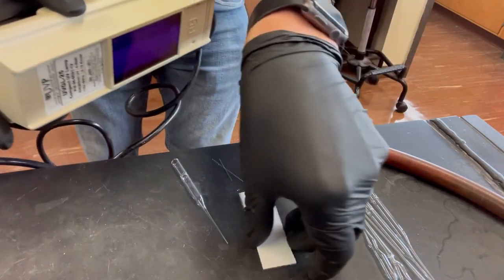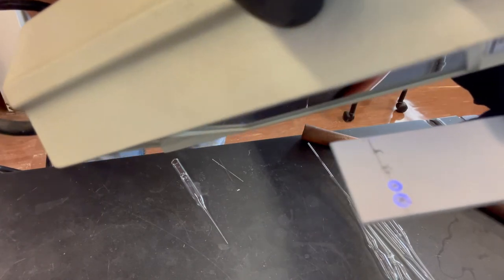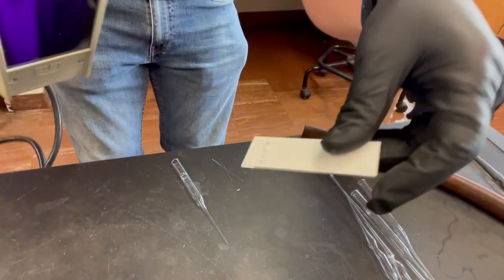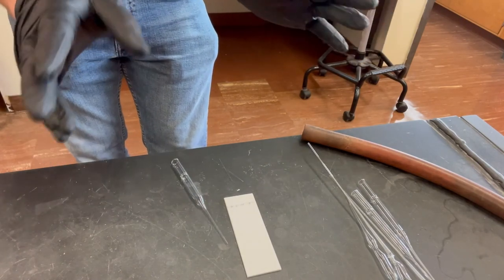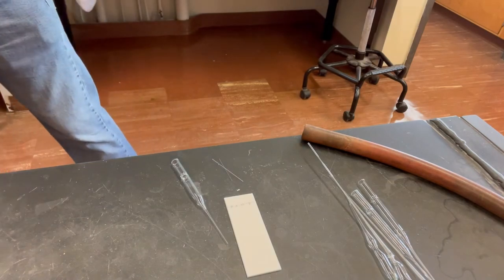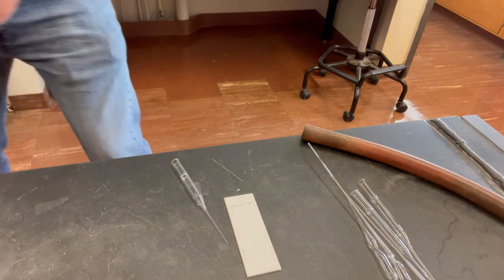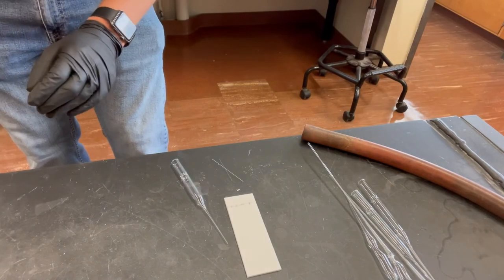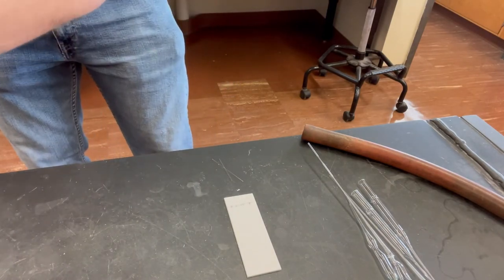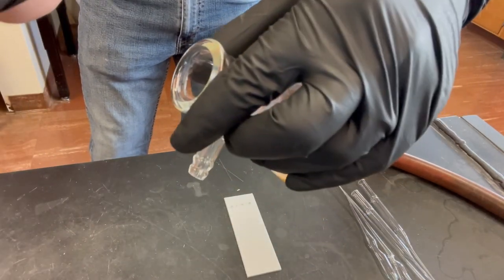So you can see, let's see, where are you at? Oh, there you go. Woo! See how that's glowing? That means we spotted our sample, right? Acetone alone does not do that. So that is our sample. It's a little big, but it's cool. We're doing what we do. Now we've got to spot the filtrate. I'm not sure if I'll be able to reach it. We shall see.